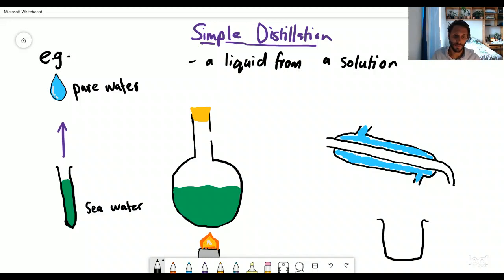So let's have a look at the pieces of equipment that you need for simple distillation. So over here we have our flask, sometimes called a round bottom flask. And this is where we are going to put our solution of seawater. Remember, seawater is salt and pure water. We're trying to separate out the liquid, the water from the salt. So here you've got your flask.